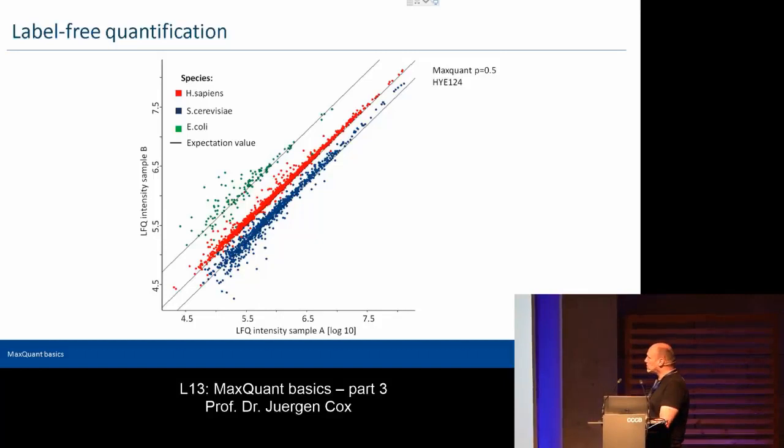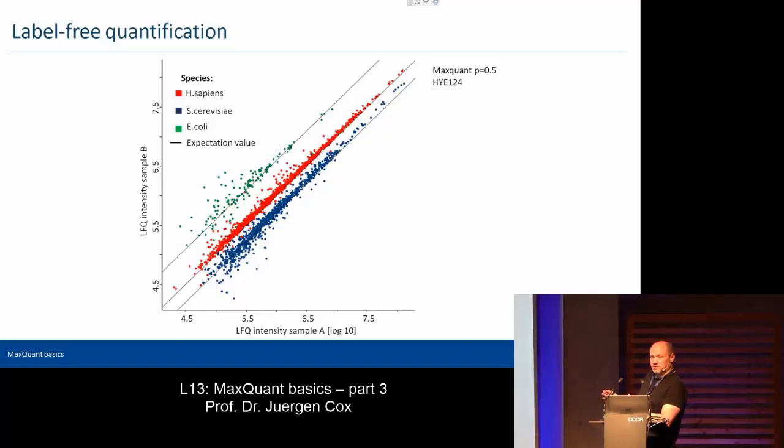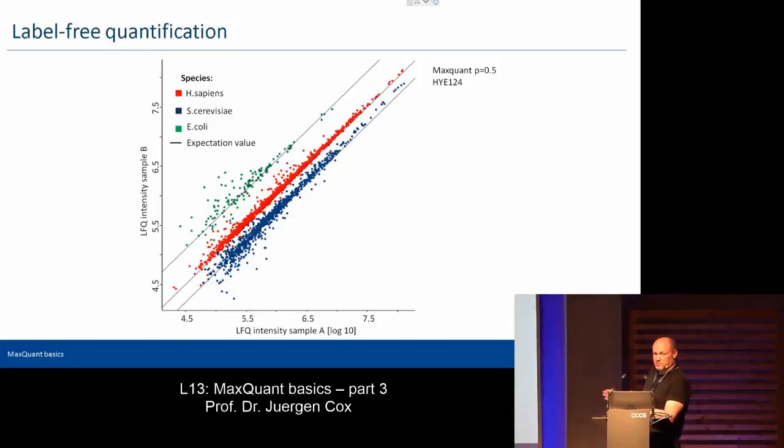And it's not only label-free that is working, TMT is also working on this kind of data. And here the promise would be that because you do have this additional dimension, the co-fragmentation problem also gets less severe, because you may then separate things that were completely co-eluting in the LCMS space by this additional dimension. You may or may not separate it, right? But at least it can only get better and not get worse.